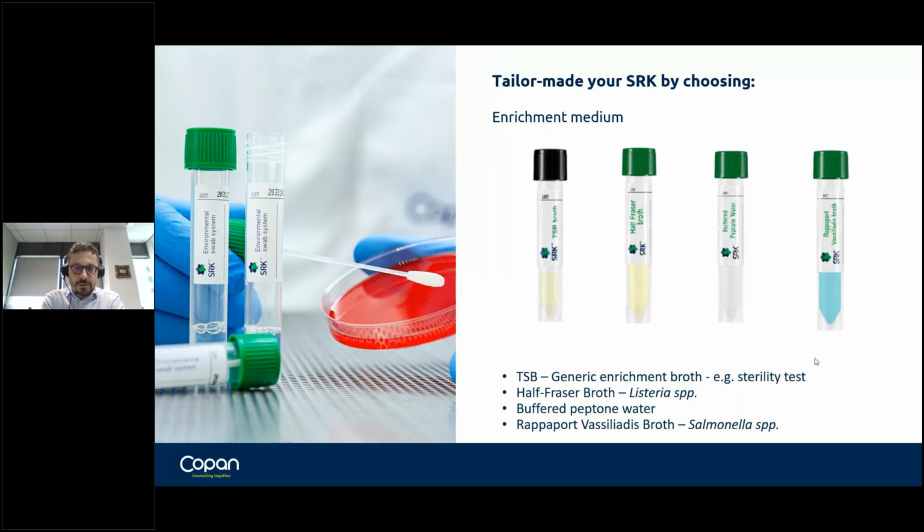We have a Half-Fraser broth for Listeria detection. We have a Rappaport-Vassiliadis broth for Salmonella detection, as well as a buffered peptone water for a generic enrichment, like for coliform. In this case, you can remove the tube with the SRK and add the enrichment broth. So you can do your collection and directly snap the swab into the enrichment broth, skipping basically the transport need.